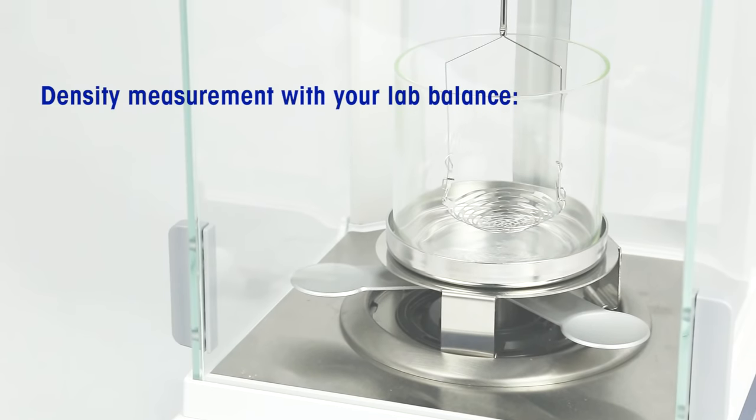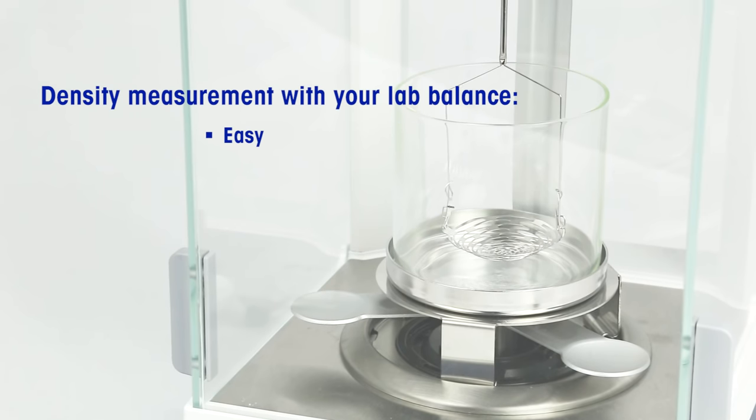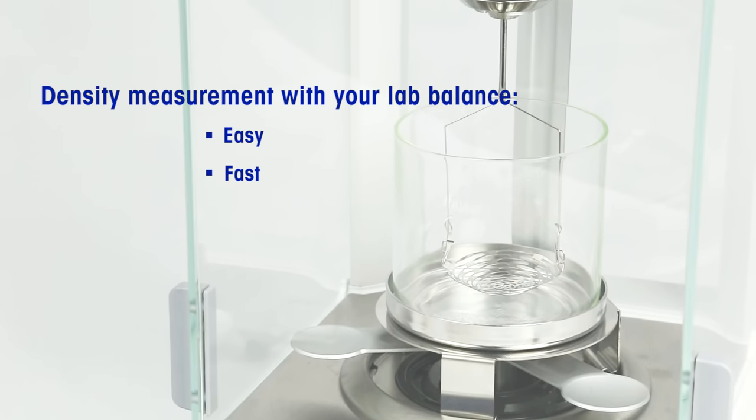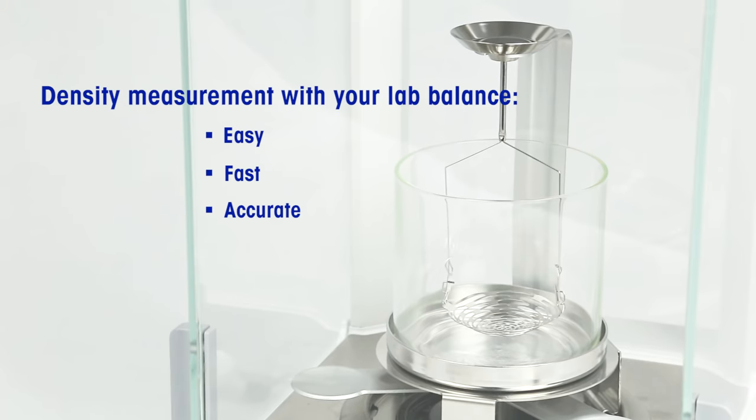Density measurement using a balance is an easy and convenient procedure that delivers fast and highly reliable quality control results.